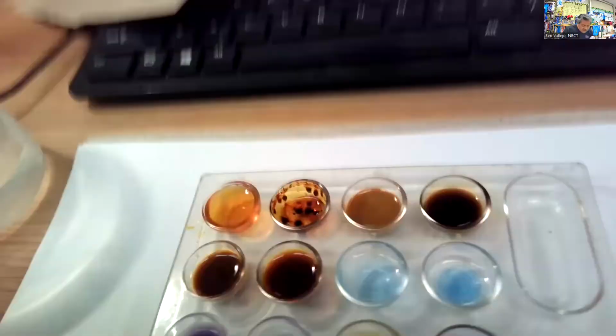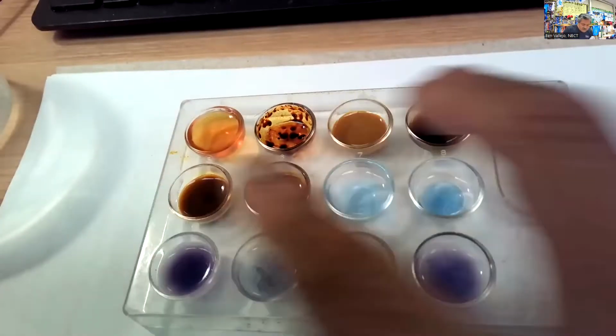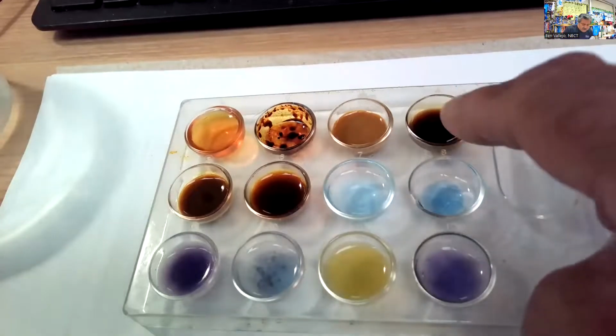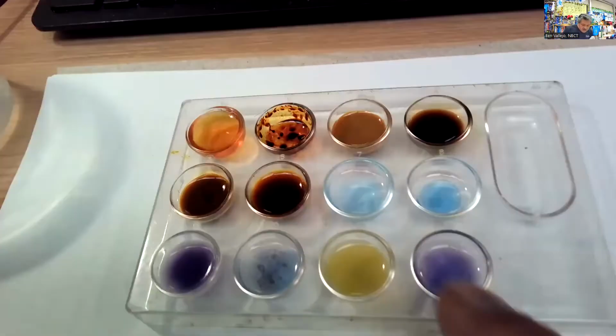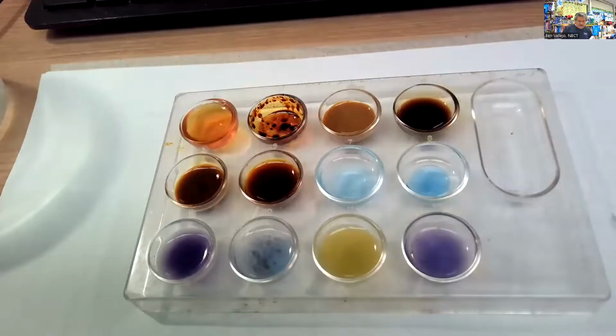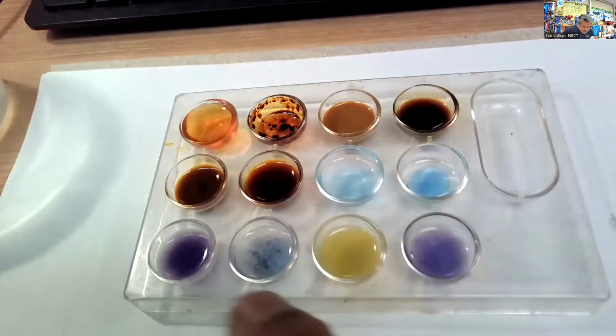You can see that 3 and 5 look very similar, kind of coffee colored, but then give you the positive test like you see right here with the oatmeal and right here with the starch. Down here, we're looking for the purple color for the Biuret test. And here's water and oil, negative for proteins.